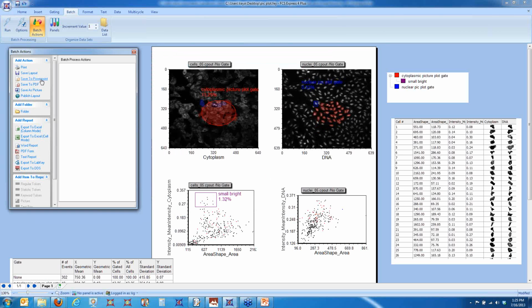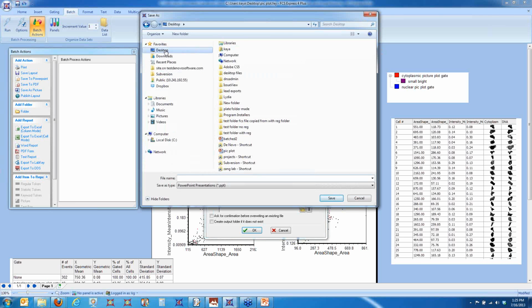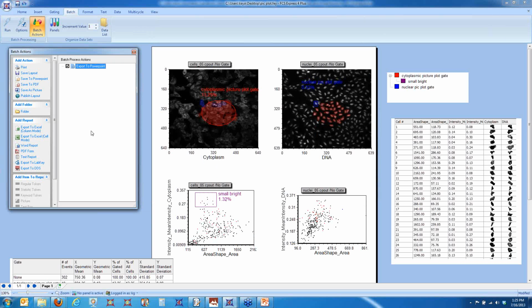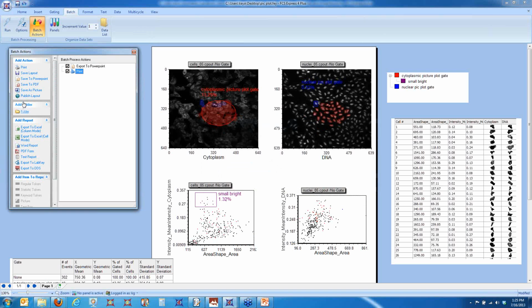Okay, so the first thing I'm going to do is let's do a save to PowerPoint, and let's send this to our desktop again. And let's also add in a print action. Okay, and you can choose between all or just one of the pages if you want.